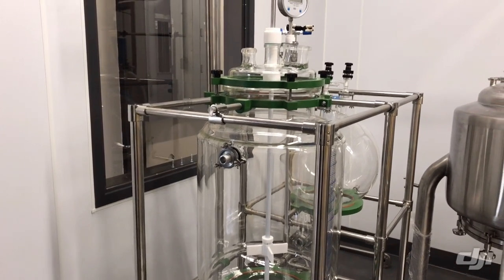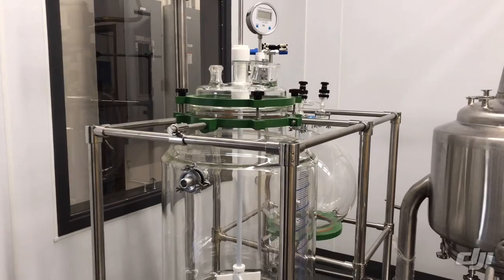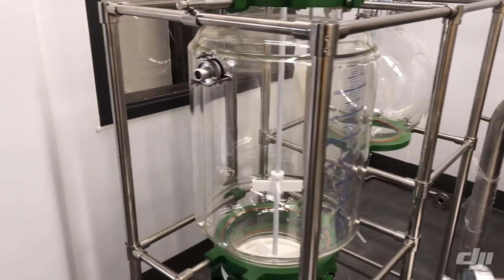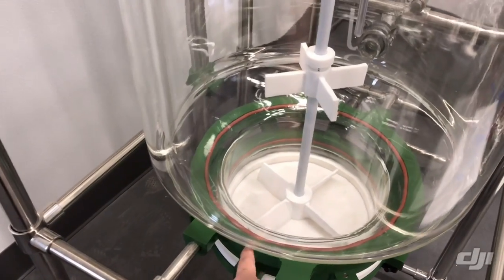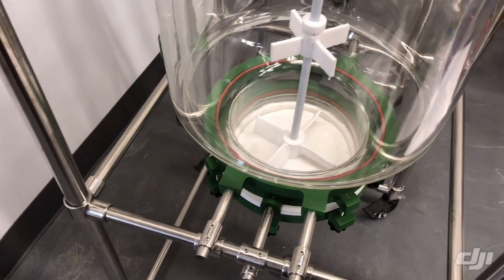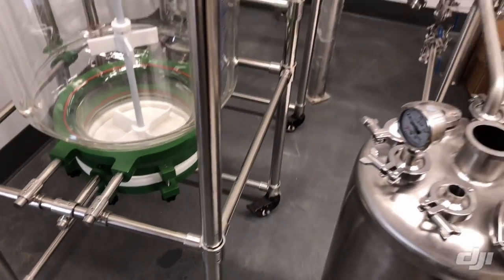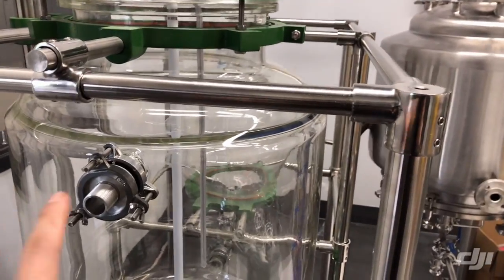Right in front of me is one of the glass reactors that my client purchased. It is a 50-liter glass filter reactor — that's what we call it, or you can call it a filter reactor or a crystallizer. Either name works. It looks like a regular reactor, but the only difference is the white bottom you see here. For a regular reactor, you don't have this type of white bottom — this is actually a filter, also called a Nutsche filter in the industry.